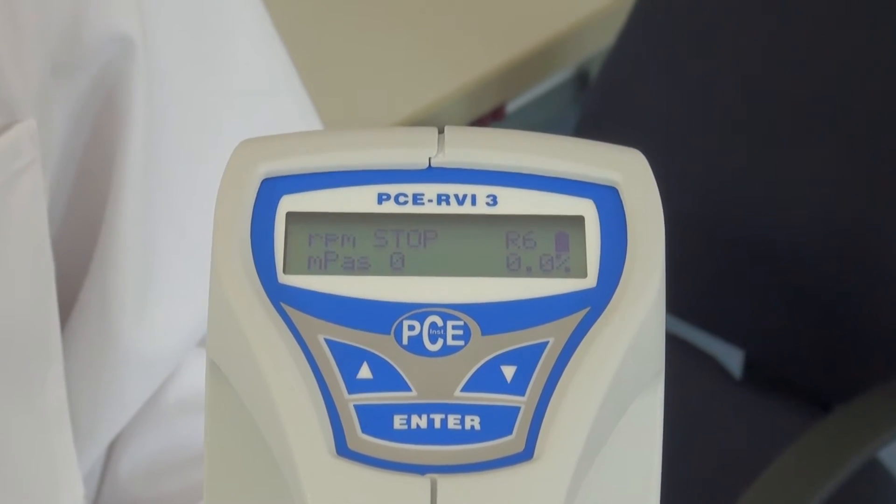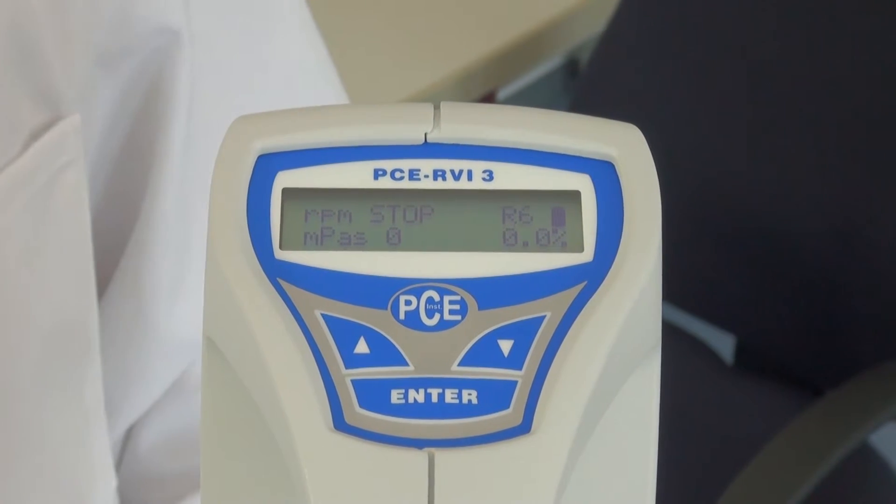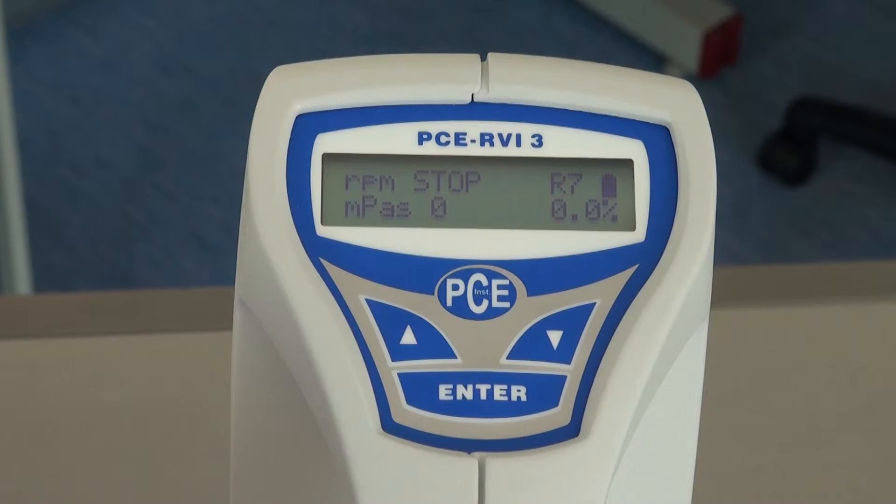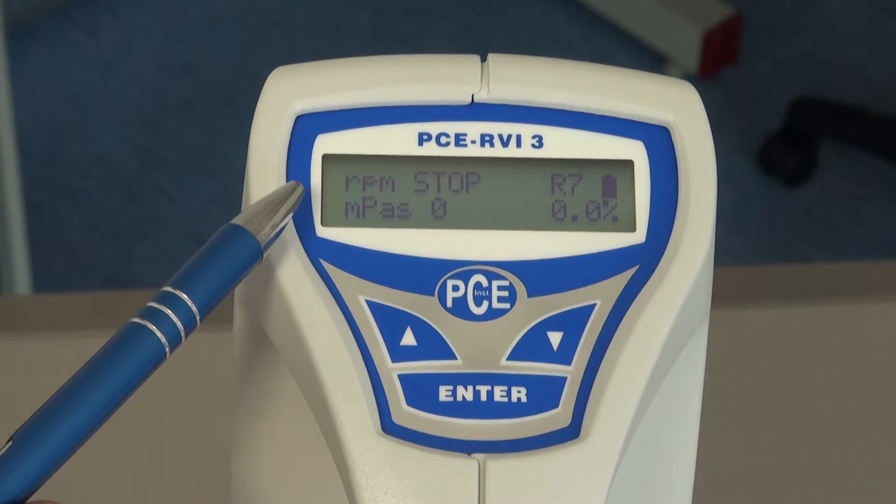Then the measuring device boots up and the measuring area is shown. What can I see? At the top I can see the revolutions per minute.